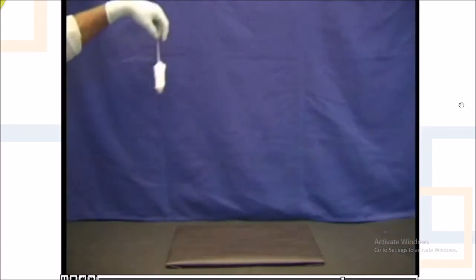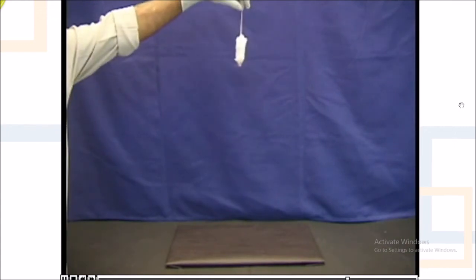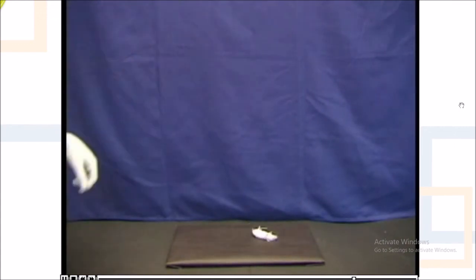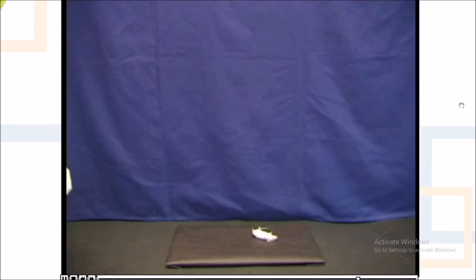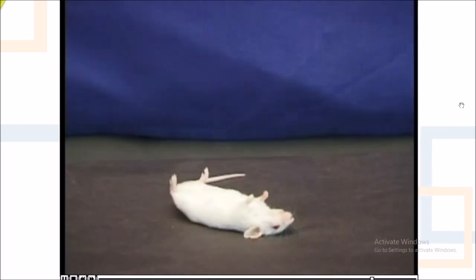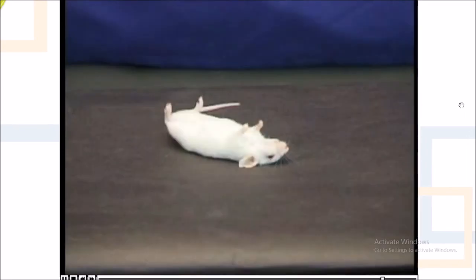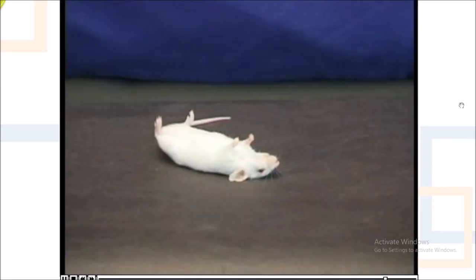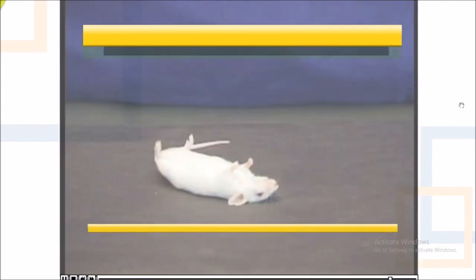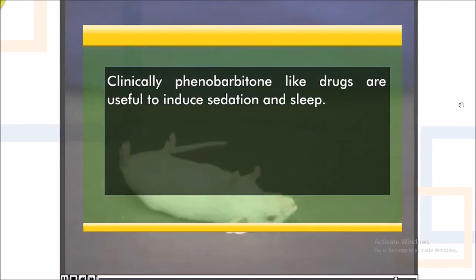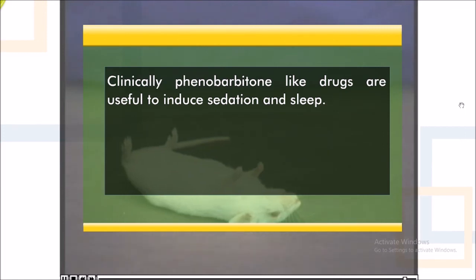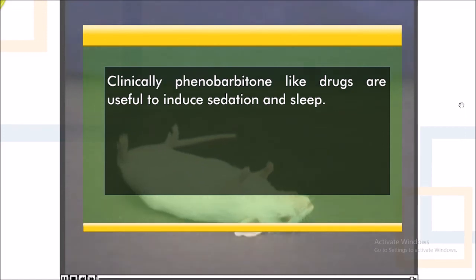Later on, phenobarbitone depresses the central nervous system, i.e., it produces hypnosis in mice. Thus, the animal fails to elicit writing reflex. Clinically, phenobarbitone-like drugs are useful to induce sedation and sleep.